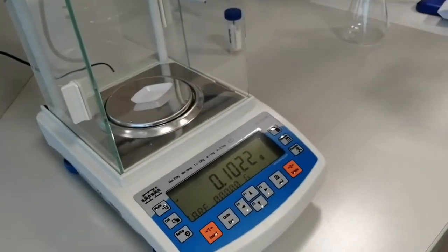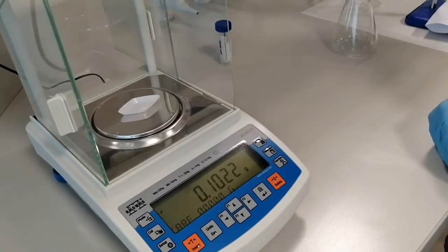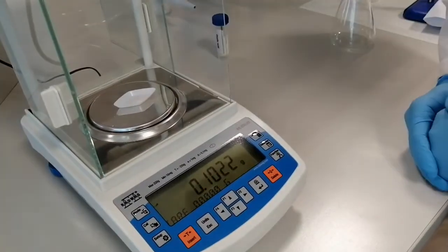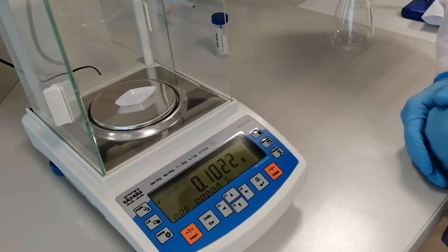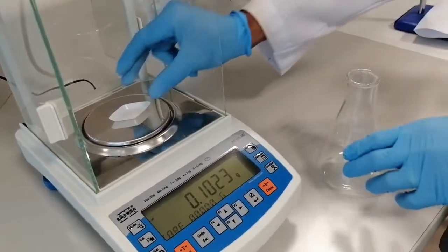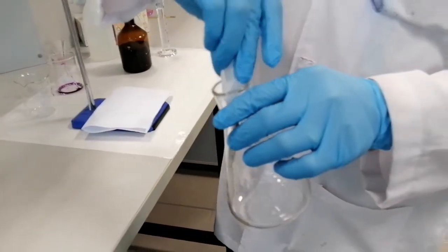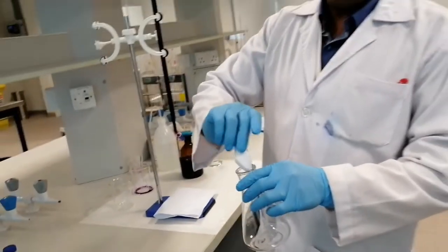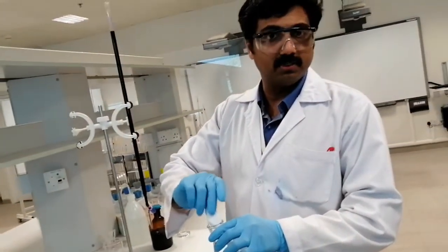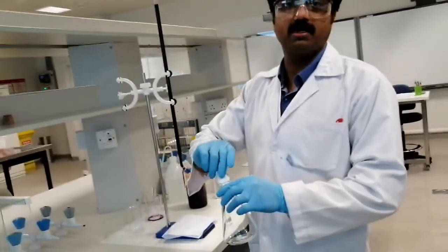Now we're going to do the second trial. For the second trial, I measured the oxalic acid — it weighed 0.1022 grams, as shown on the balance screen. I'll transfer it into the Erlenmeyer flask, dissolve it in sulfuric acid, go back to my burette, and start the titration.